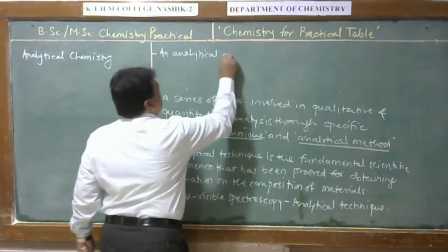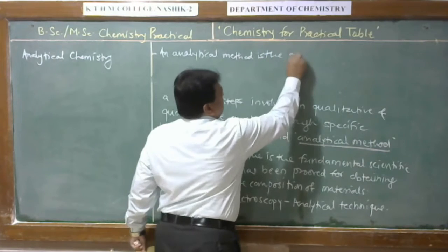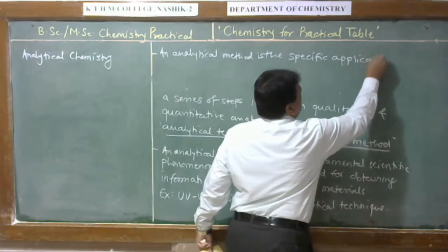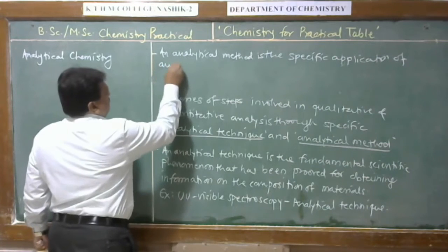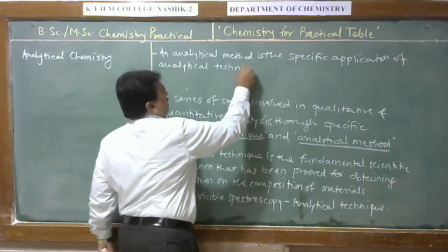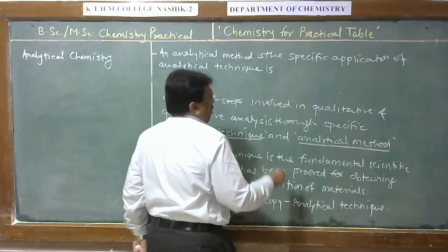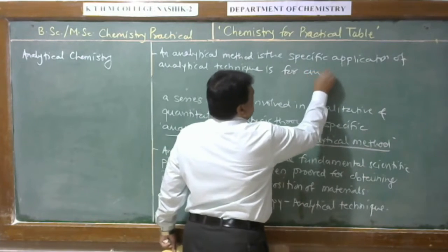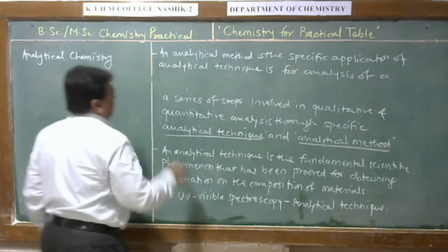An analytical method is the specific application of analytical technique in analytical chemistry for analysis of a sample or a substance.